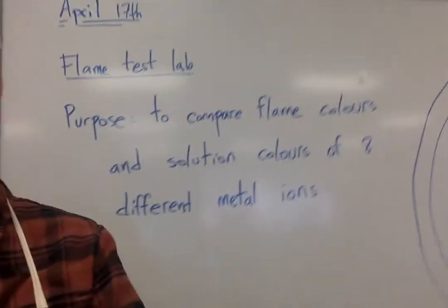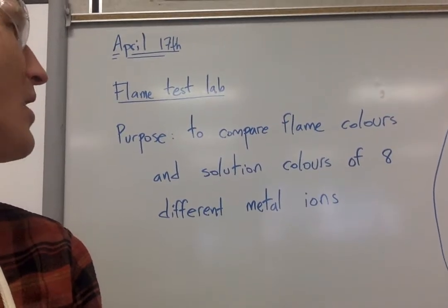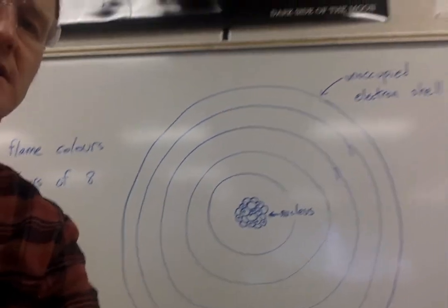So first of all, purpose is this. We're going to compare the flame colors, or also I sometimes say flare colors, and solution colors of 8 different metal ions. You're going to see what those are in a moment. I'd like you also to look at this.